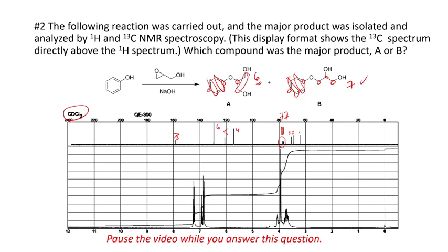And the fact that we have 7 lines tells us it's product B. This is very common, to be able to distinguish compounds by the number of carbon signals. Very quick analysis. You don't have to learn anything about the splitting because there's no splitting in a C13 spectrum. There's nothing about integration in the C13 spectrum. It's just a bunch of lines. So if you can detect those lines, see that they match your number of carbons, you can continue, but if they are not, it can't be that compound.